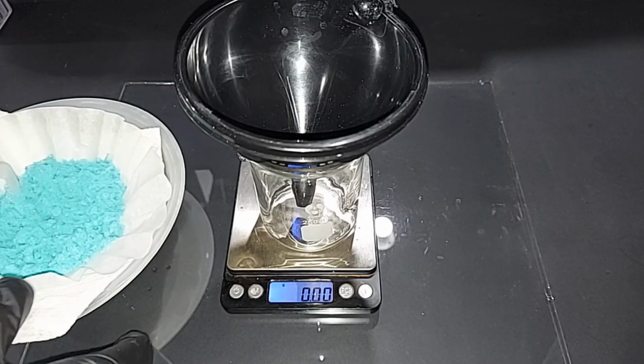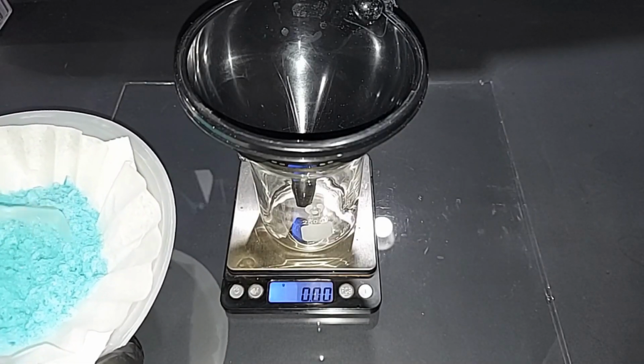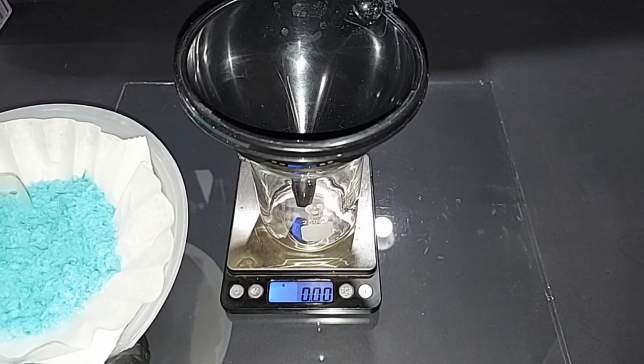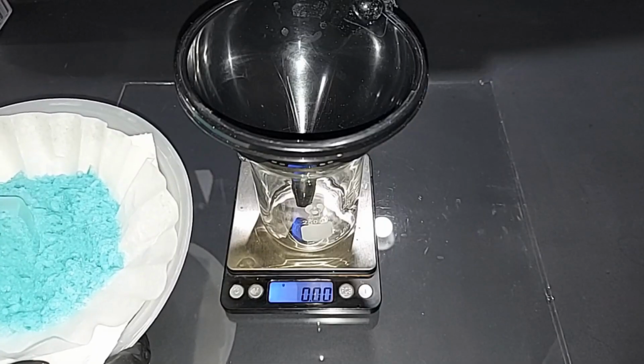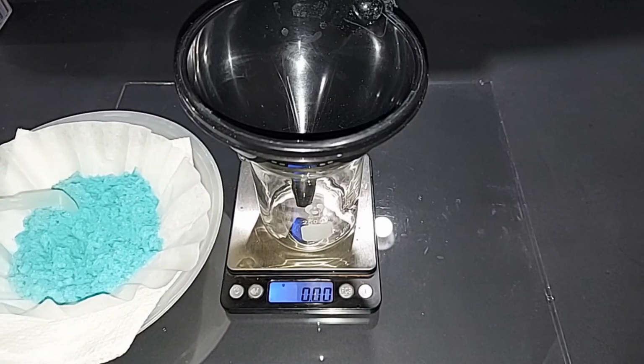I just want to comment on the color. This is the right color of pure copper 2 chloride. You will see it in darker forms sometimes when it's made. If you have excess hydrochloric acid and/or excess water in here, it'll be a darker green. So you want this light blue color. If you order it from a chemical lab, this will be the color you're going to get.